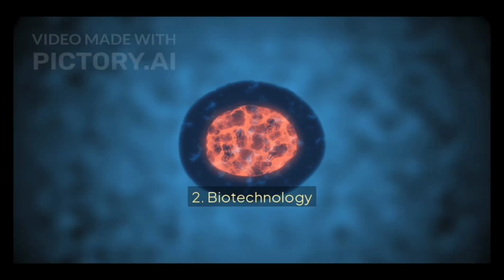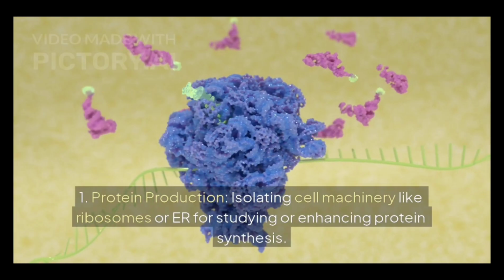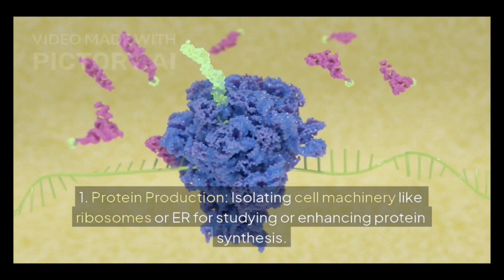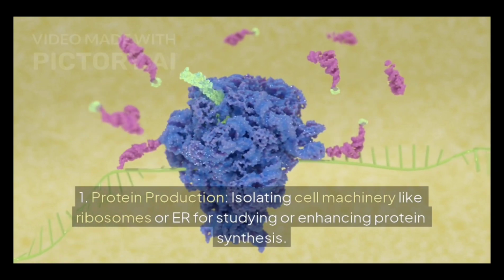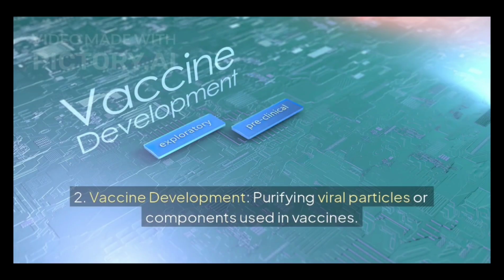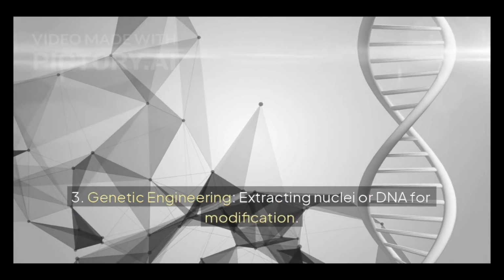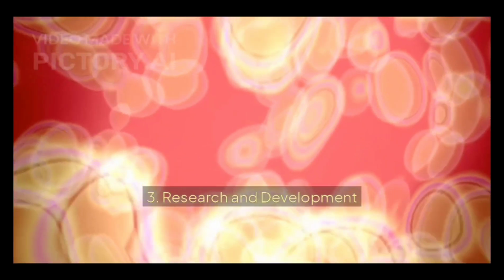Secondly, biotechnological applications. It is used in protein production, isolating cell machineries like ribosomes for studying or enhancing protein synthesis. It is also used in vaccine development, purifying viral particles or components used in vaccines. And obviously in genetic engineering, extracting nuclear DNA for modification.